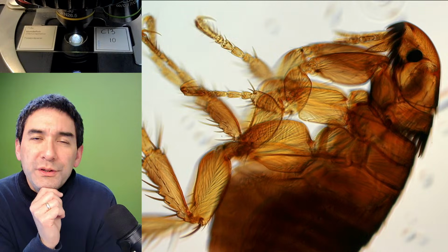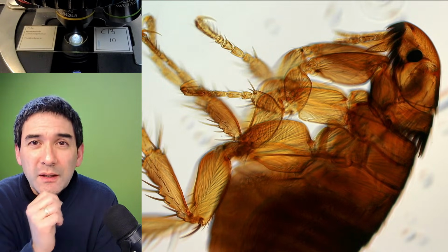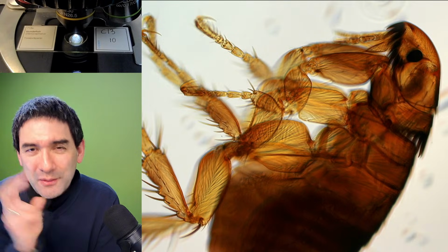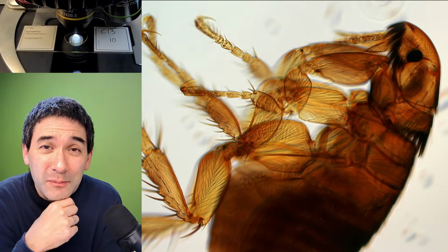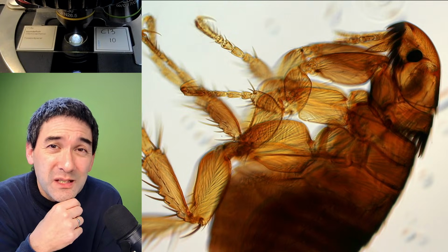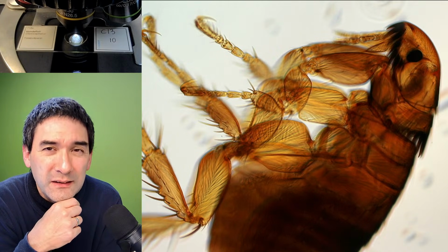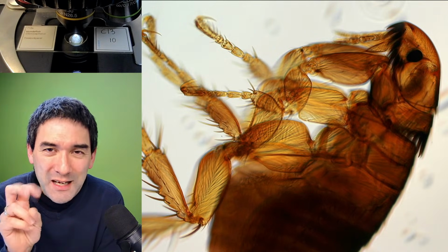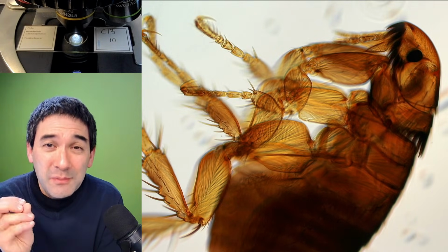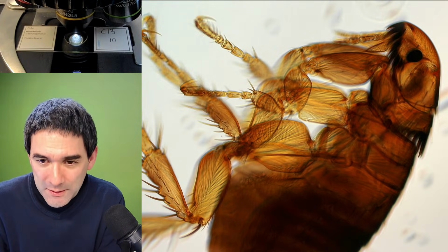when you're taking a natural sample, a pond water sample or whatever, I mean, there's so much dirt, dirt in quotation marks, in there in any case, that sometimes it doesn't make a huge difference if the slide is perfectly clean or not. Okay? I'm just saying the biggest contamination actually sometimes comes from the specimen itself.